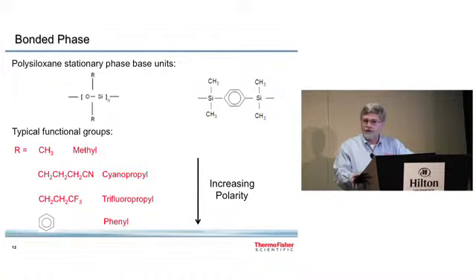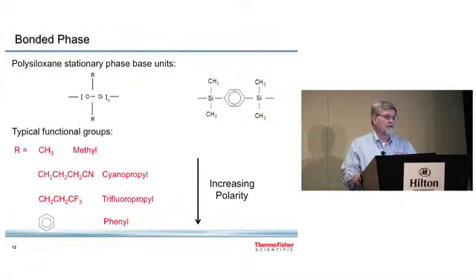And that's really great when you're doing EPA methods like semi-volatiles, 8270, where you have 147 compounds that you're analyzing, and they're all different types of compounds in the mix. But if you're looking for a specific type of compound, just phthalates, or dioxins, pick a column that's specific because you'll get better results.